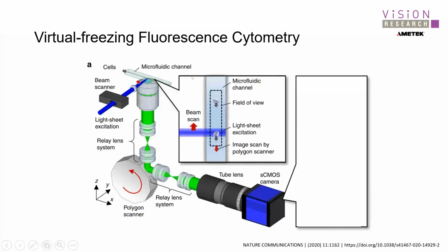So what they have here is these cells going through a microchannel over this field of view.